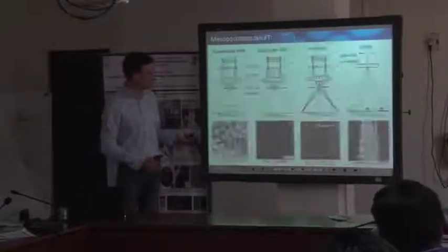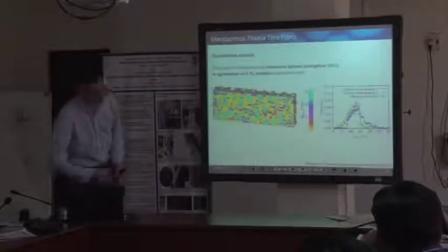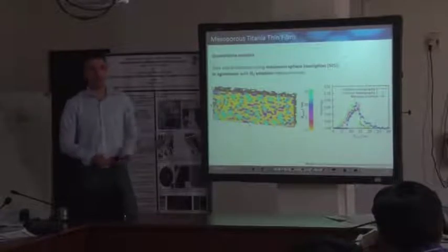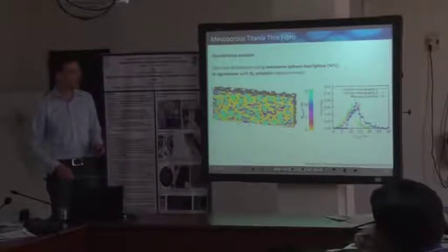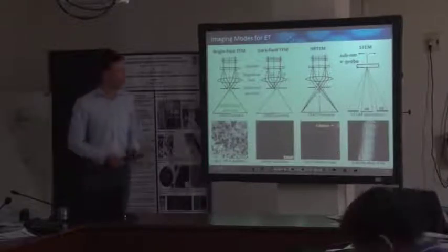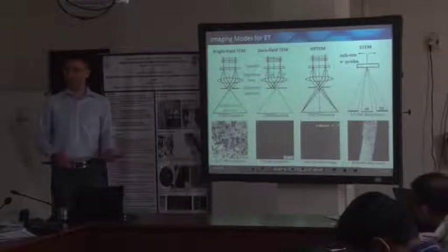But in principle, what people came up with in this particular case was diffusion coefficients through those layers based on our measured distribution of pores and the interconnectivity of the pores. So maybe for catalysis, this is one major question, how pores are distributed. And this was just one example about scanning TEM imaging as a mode to record those projections.